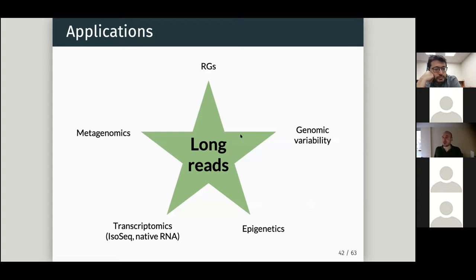So we are big fans of long reads. I think Olivia and I attended most of the conferences about long read sequencing out there in the world. I would say we are, Olivia much more than me, early adopters of this technology when basically it didn't work. And you had to have faith that it was actually possible to use it before you get started. Now it's to the point that we can say that it can entirely replace Illumina, except for the cost. Maybe it's an overkill for some cases, but again, it's there at this point.